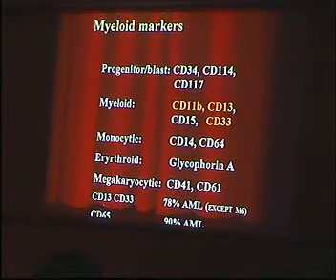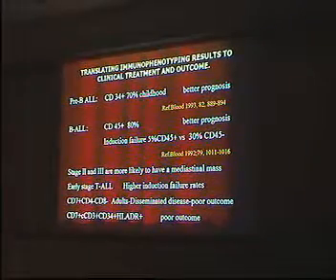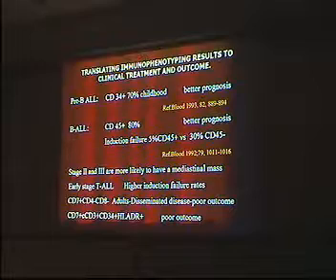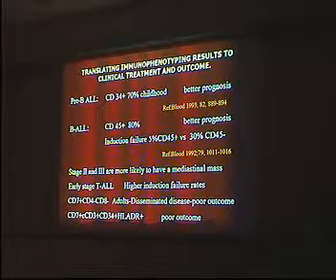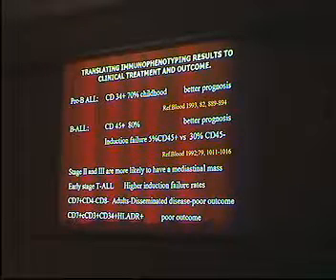Please remember, in AMLs, 78% of the times, CD13 and CD33 is positive. HLA-DR negativity has its value, and I'll show you the next slide. HLA-DR negative is very helpful in diagnosing APML. If you have a pre-B ALL, which is also CD34 positive, I didn't show you CD34 because we've been too busy. If they're also CD34 positive, as occurs in 70% childhood, very good prognosis. We'll tell the parents, spend.